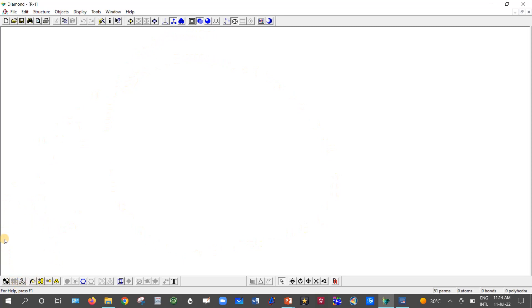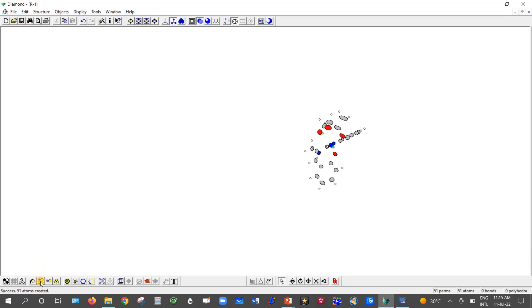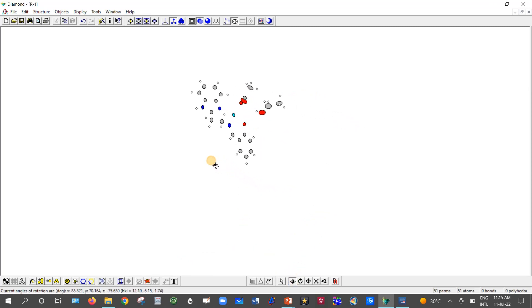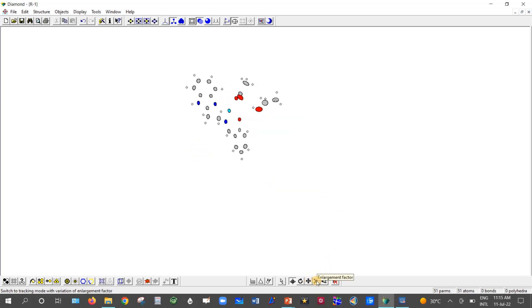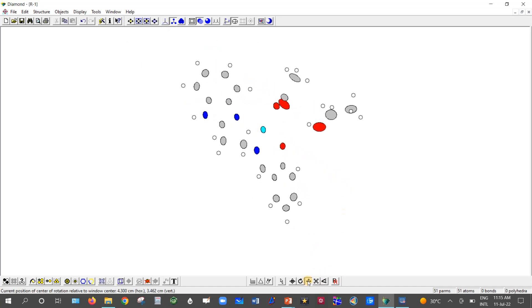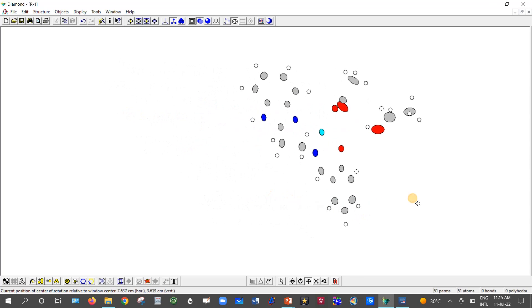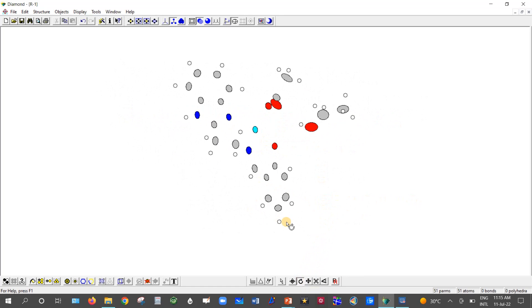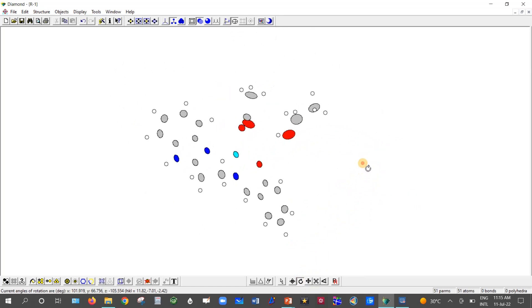Now come to the left bottom part of the software. Choose the button 'Add All Atoms' and click on it — you will see the atoms appear on screen. You can then use the rotation option to rotate along x and y axes. There is also an enlargement factor to enlarge the molecule, a shift option to move the molecule, and a rotation Z option to rotate the molecule along the z-axis.